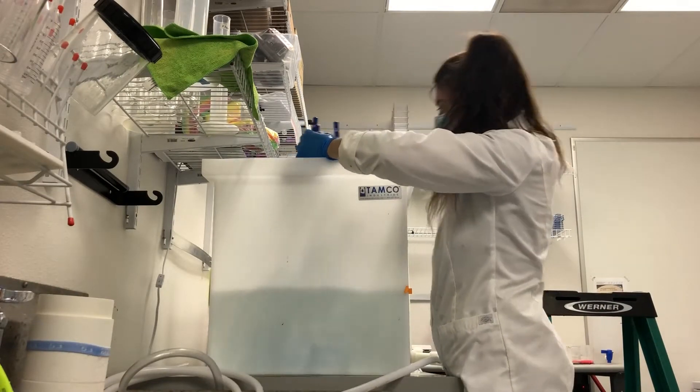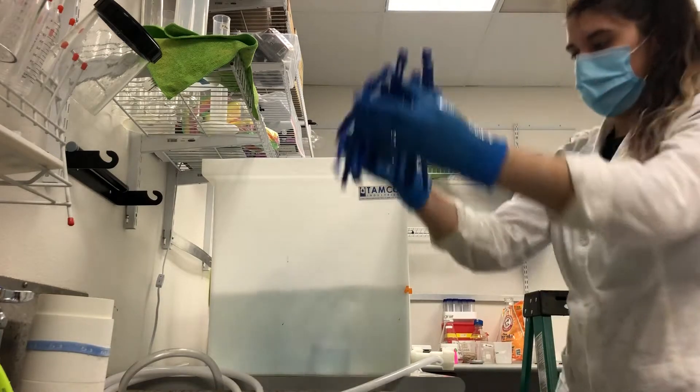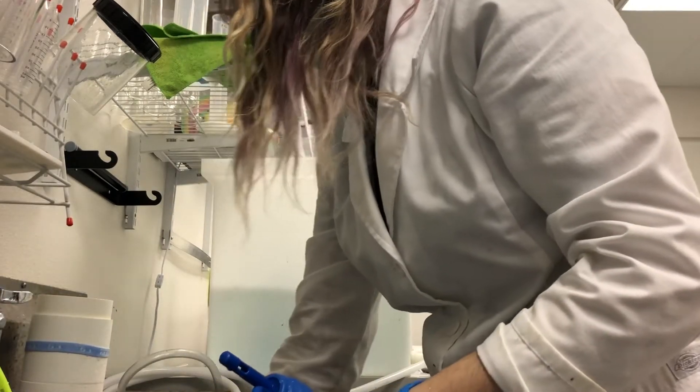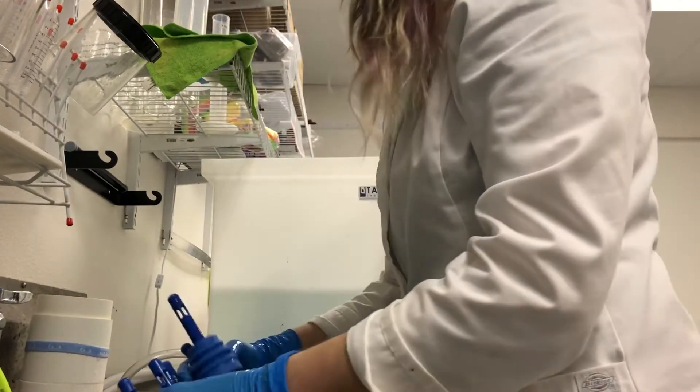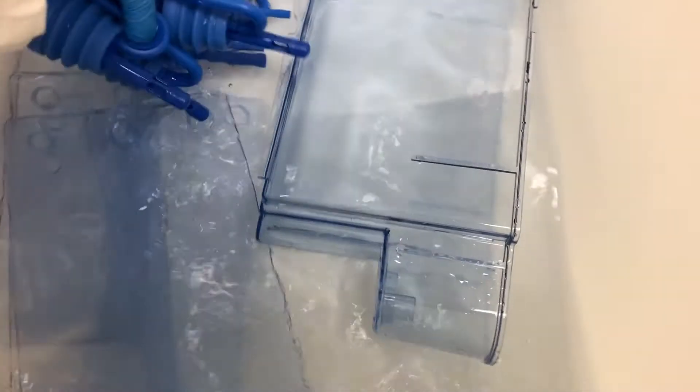After the bleaching period is done we'll remove the dishes and rinse them under tap water. The bleach is very harmful to fish so to make sure any leftover bleach is inert we place the dishes into a sodium thiosulfate bath for a few moments.